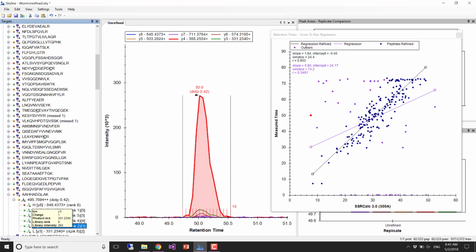And then you can look at this other one, which is Y3, which is probable. Y5 is not that probable, and then maybe Y6. But Y3 and Y4, so why should we not trust when we see co-eluting Y3 and Y4, but not really anything else?